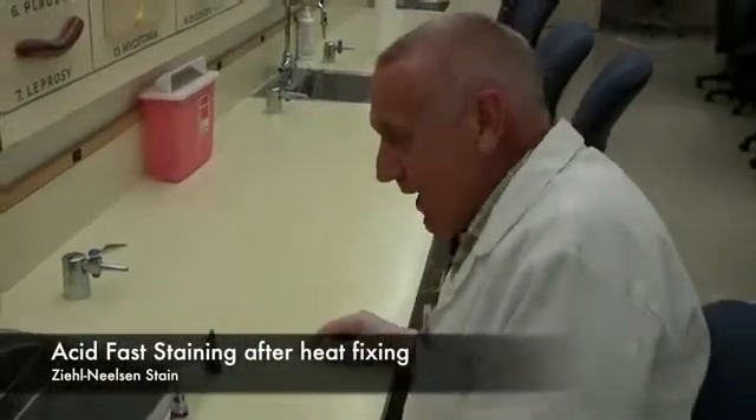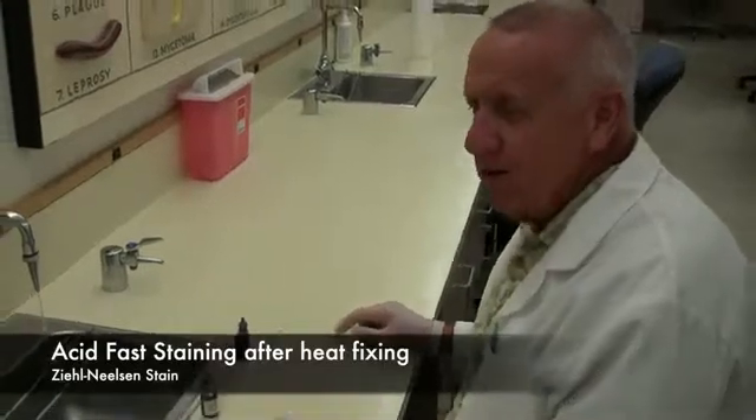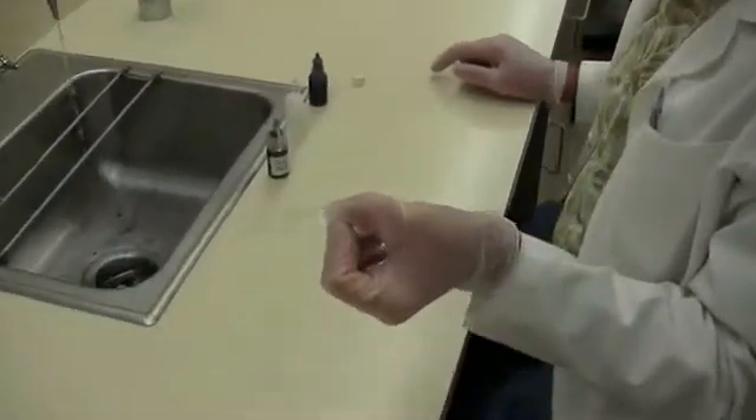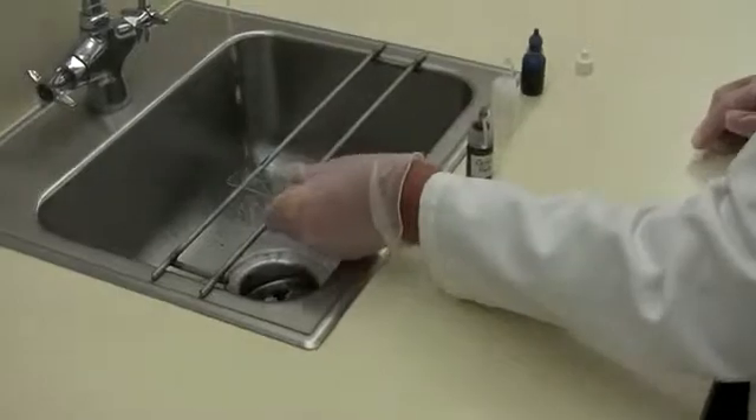Now I'm going to show you how to do an acid fast stain. I have already prepared sputum slides for you and they are already heat fixed. Ordinarily you would make a smear and heat fix it and then start your staining.